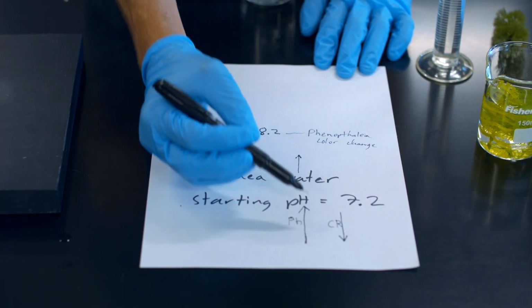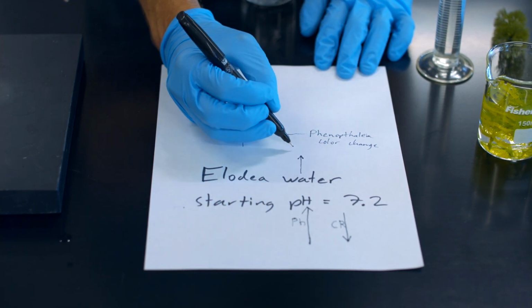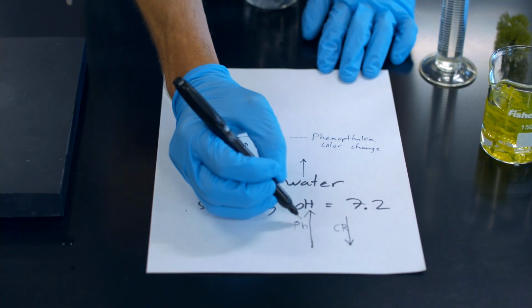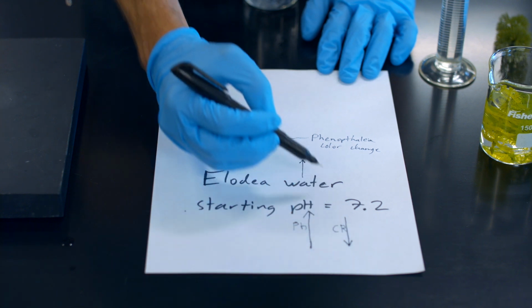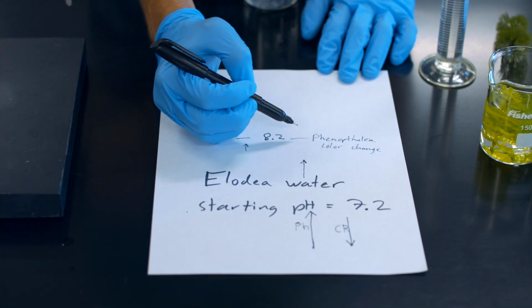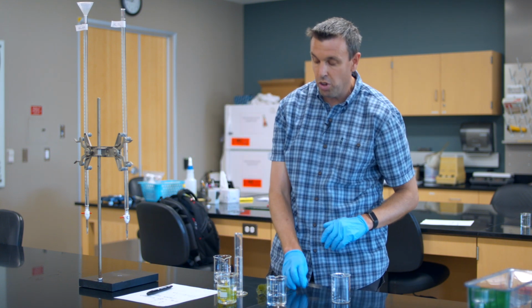And so if something's doing a lot of photosynthesis, it's not going to need as much titration to become pink. If something is doing very little photosynthesis, it's going to be a long ways away from 8.2 and it will need more titration. That's our analysis. Right? But again, we have some controlled variables.